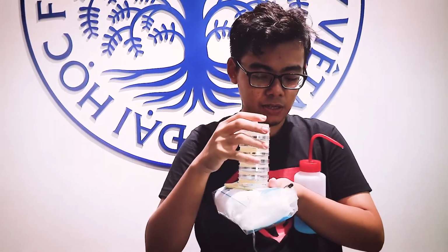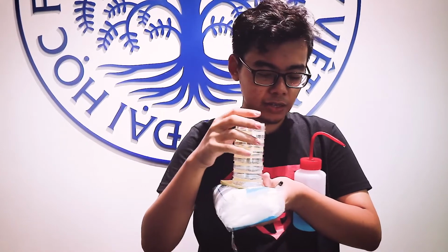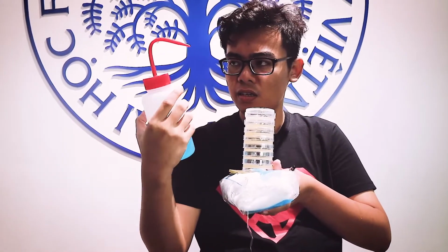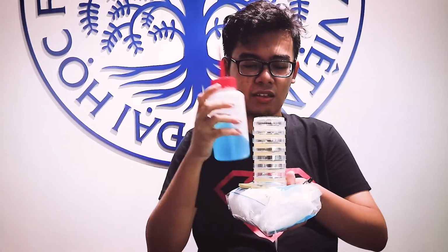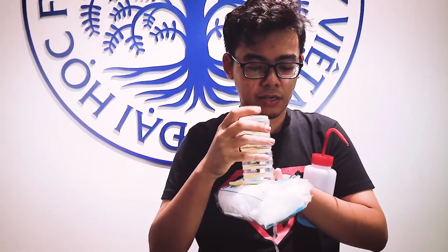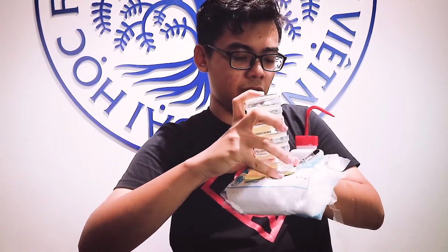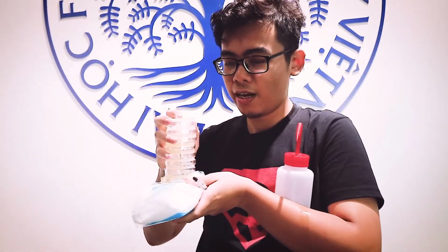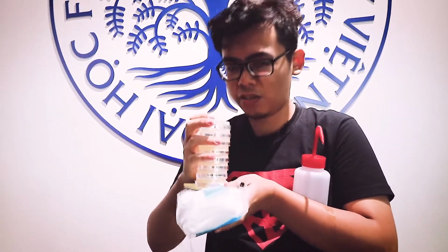Cotton swabs, make sure they are sterilized. 70 degrees alcohol, it's ethanol, for washing stuff. I have sticky notes and a pen to label each plate after each collection.